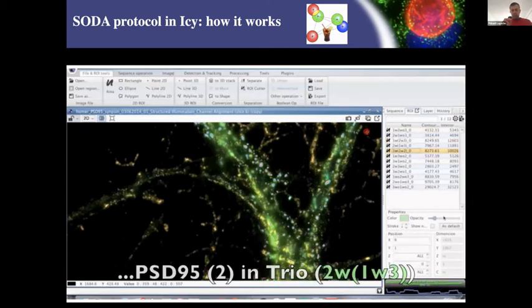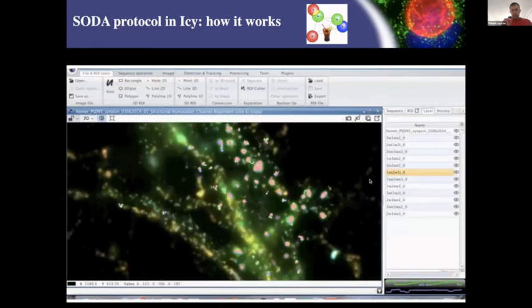synapses. Also the same with synapses that are in trio. And so I'm going just to show you where are the synapses with 3 molecules. And above that, we have, for example, synapses with only 2 spots, PSD and Homer, or some with only Homer and synapsin, etc. So at the end we have a lot of information, and then you can do a lot of graphs.